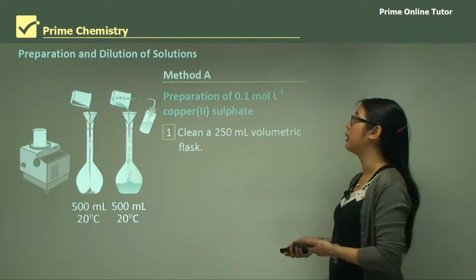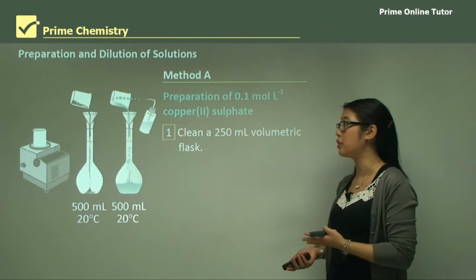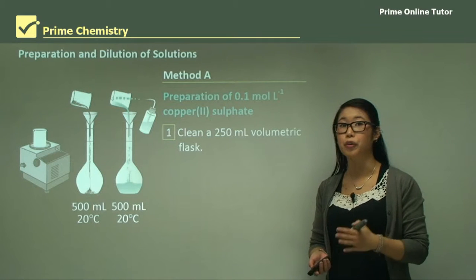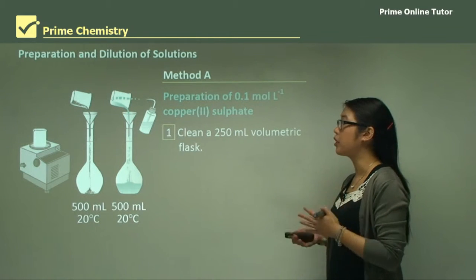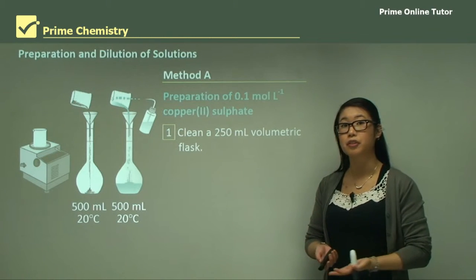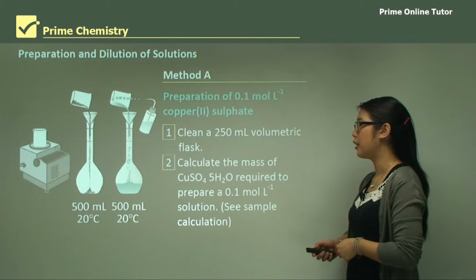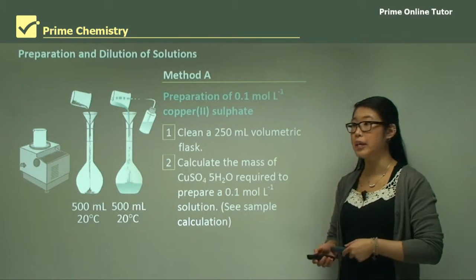First we need to clean the volumetric flask. The volumetric flask is really important because it gives us an accurate volume of the water, and therefore we can calculate a very specific concentration. So first we clean it, and then calculate the mass of copper sulfate that we're going to add to it.